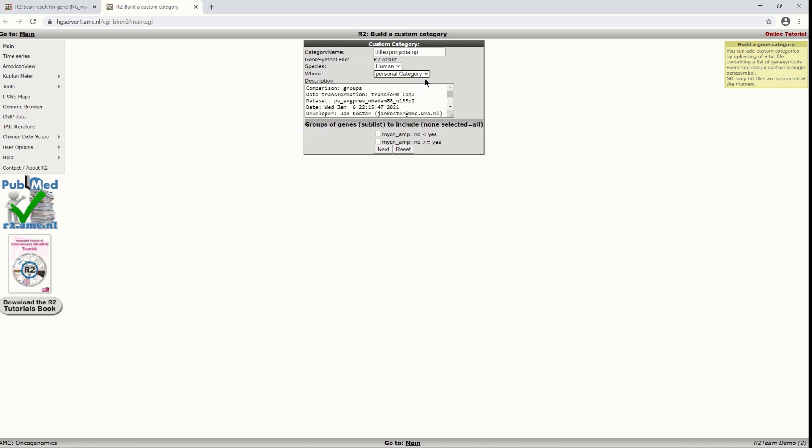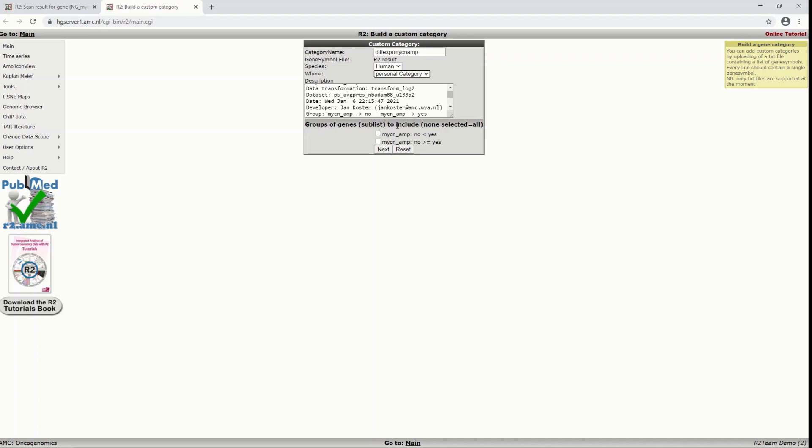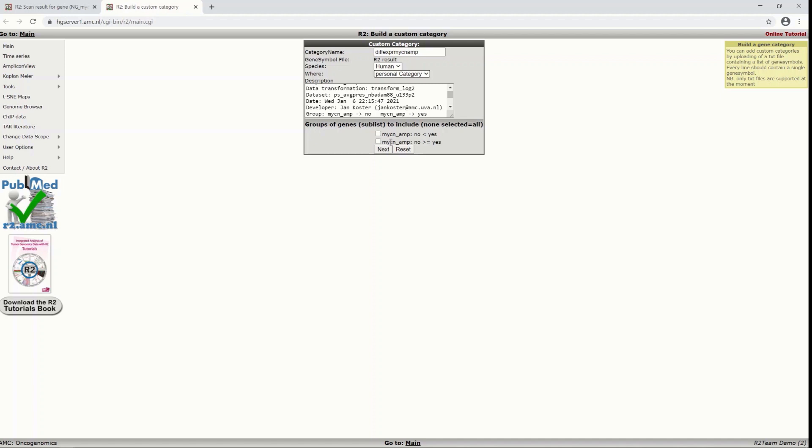You can see a description of how this was generated and you can also choose which groups to include. If you only want to include genes that are higher expressed in the MYCN amplified group, then you should click this one. If you want the other way, that only genes are included that are higher expressed in the non-amplified group, you choose this one.